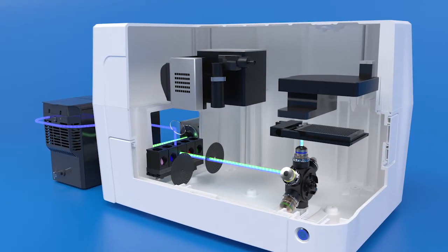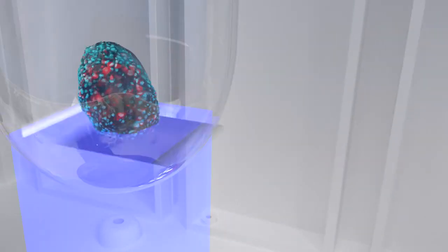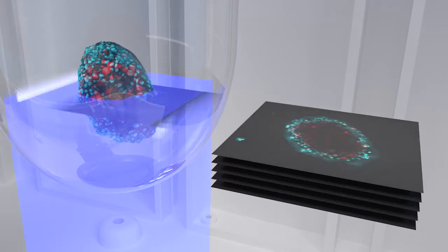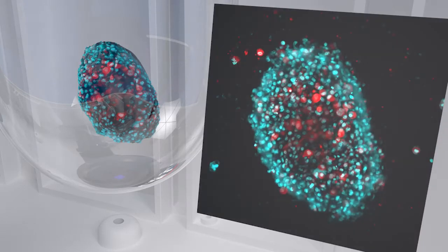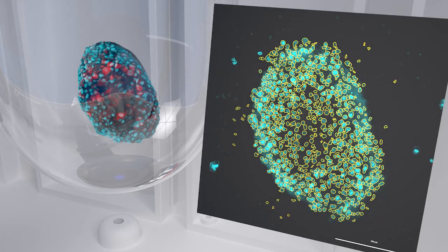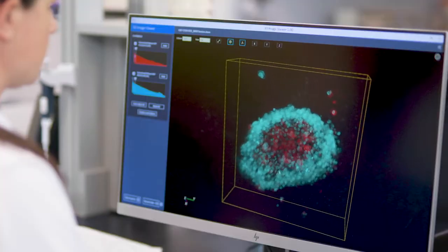For example, this common spinning disk confocal image processing workflow quantifies cells in a 3D spheroid. A Z-stack is captured. Then, Gen5 processes the stack of images to count individual cells in the spheroid. A 3D viewer is used to explore the sample in greater detail.